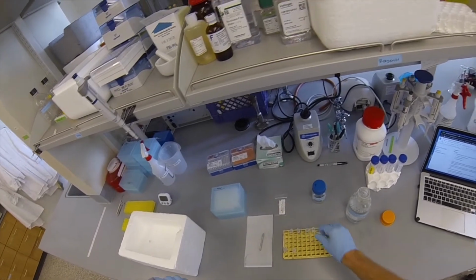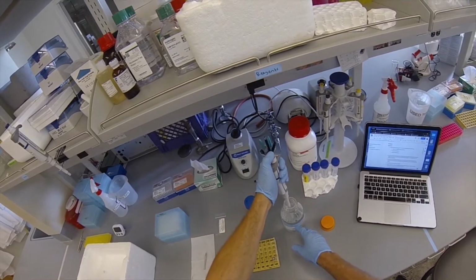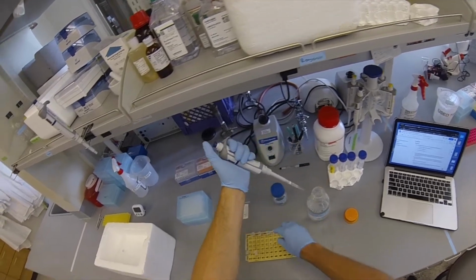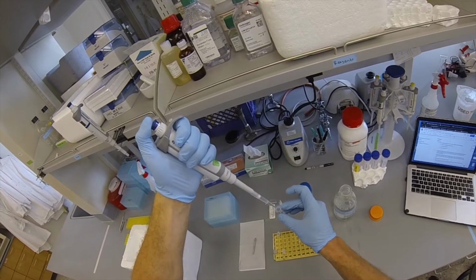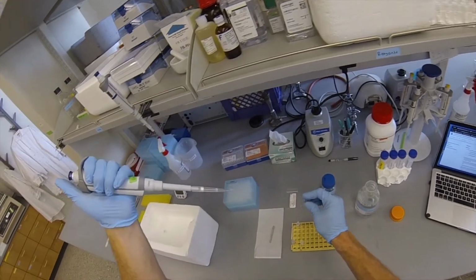As you pipette into each sample, make sure to shift the samples down one row in your test tube rack so you can keep track of which test tubes you've inserted the SDS cell lysis buffer into and which ones you haven't.